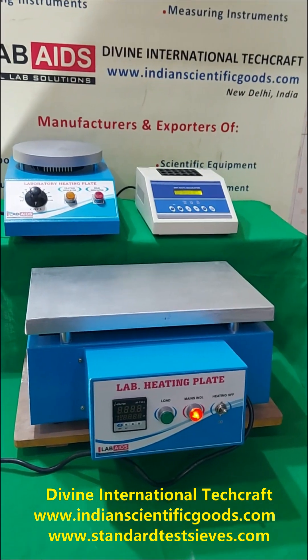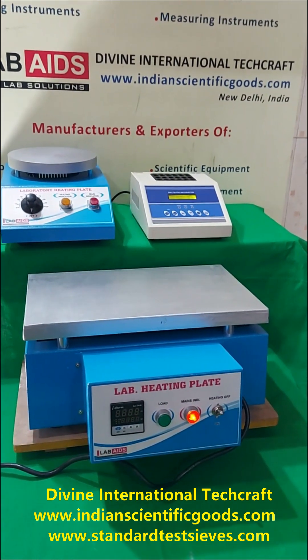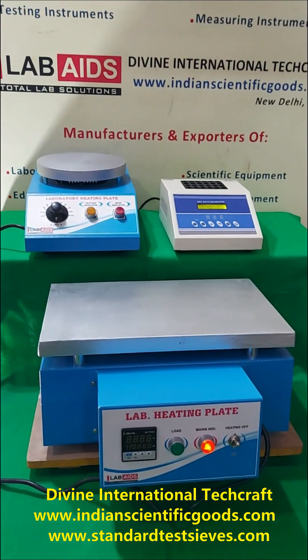The outer body of these hot plates is made of mild steel and is powder coated. The heating tops are made of stainless steel or cast iron or mild steel as per the requirement.